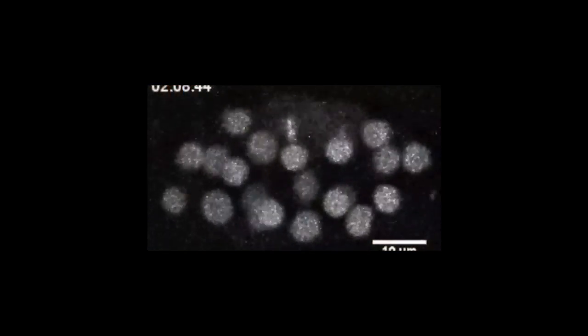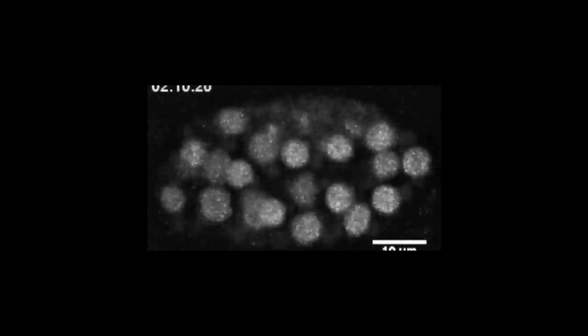We use a worm, a nematode that's called C. elegans as a model organism. In this movie you're seeing an embryo of C. elegans as it's developing.